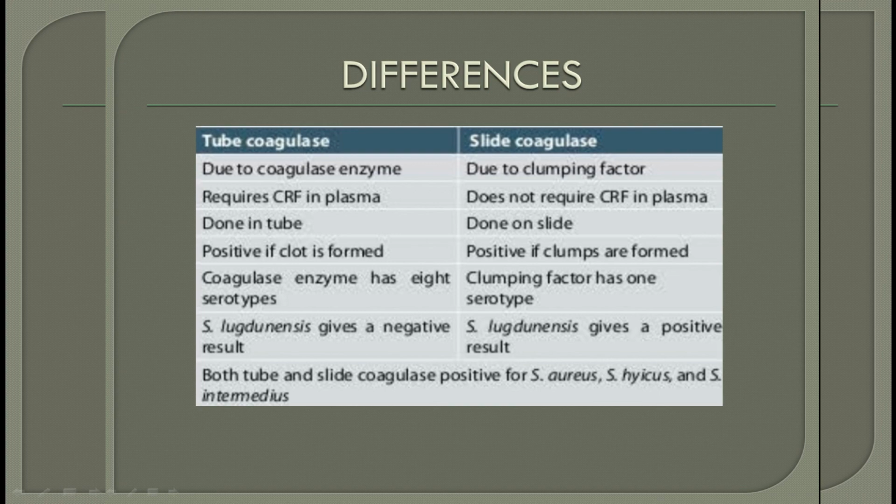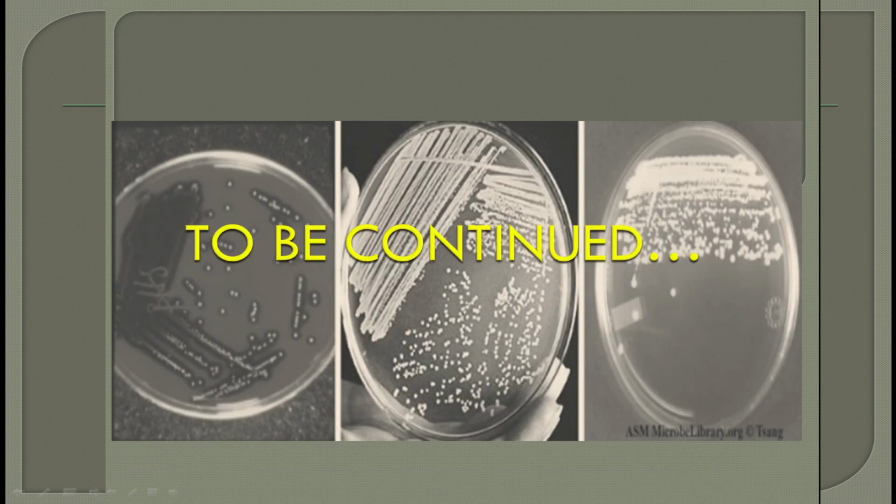Okay. So with that, we end coagulase. This was a small discussion, not much to have said, but it was an important discussion, I think, because this is very relevant to the lab diagnosis and is the most important diagnostic test for Staphylococcus aureus.